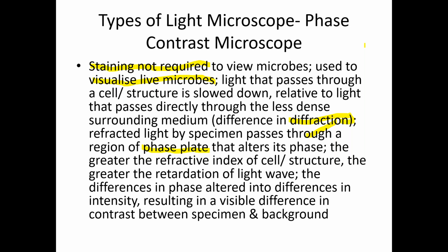So again, we come back to the phase contrast microscope. The greater the refractive index of the cell or structure, the greater the retardation of the light wave.